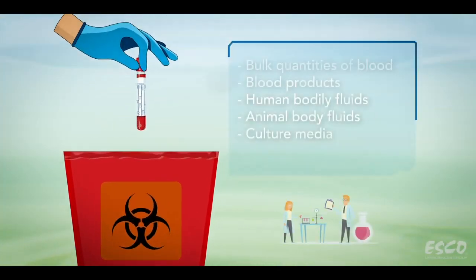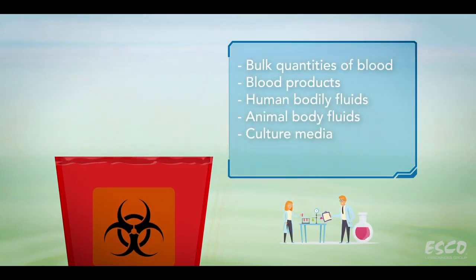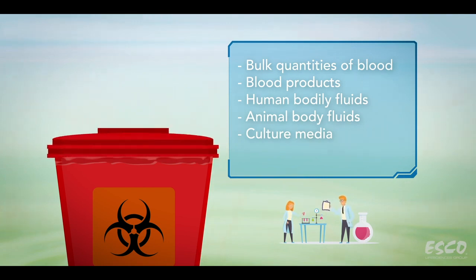Liquid waste includes bulk quantities of blood, blood products, human bodily fluids, animal body fluids, and culture media. These liquids must be stored in closed, leak-proof containers while awaiting treatment and disposal.